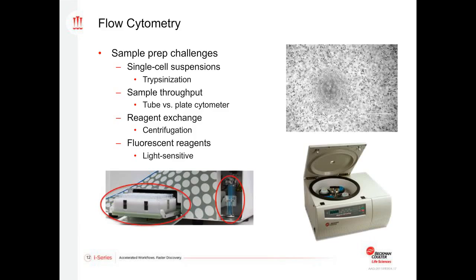Another consideration is that most of the workflows for flow cytometry, such as antibody staining workflows, require a centrifugation step to pellet the cells, allowing you to perform reagent exchanges, such as antibody washes. Another consideration is that most of the reagents are fluorescent, and so this typically means they are light sensitive, so you need to consider how long you're able to leave your reagents on the deck of your instrument. And we'll talk about each of these requirements as we go forward.